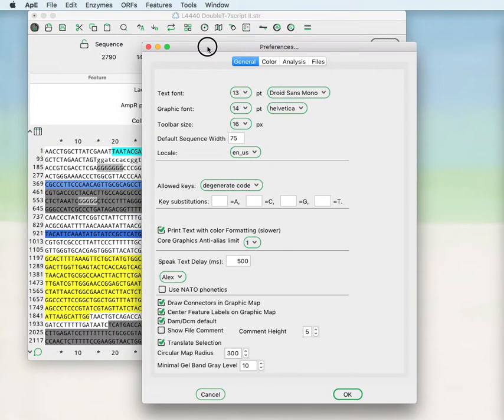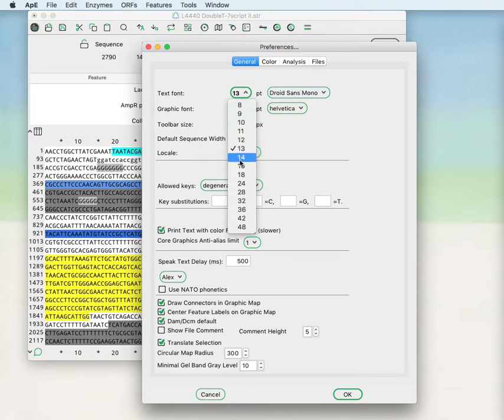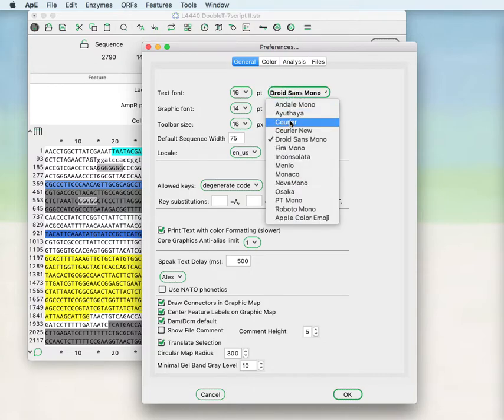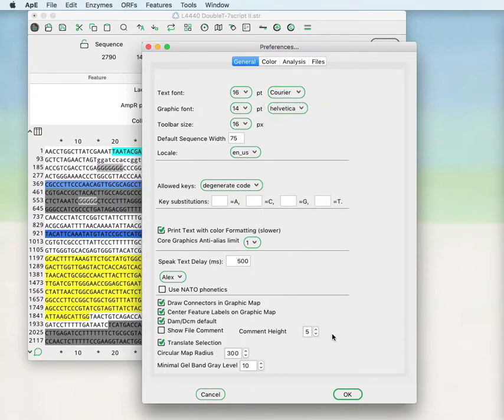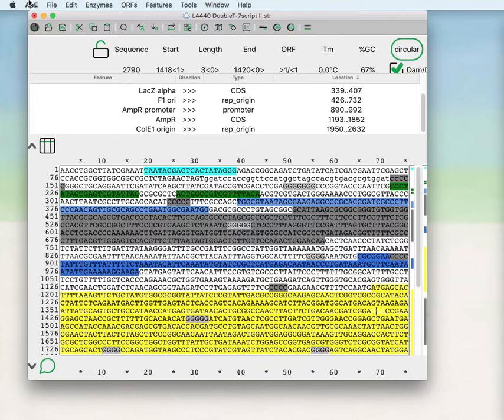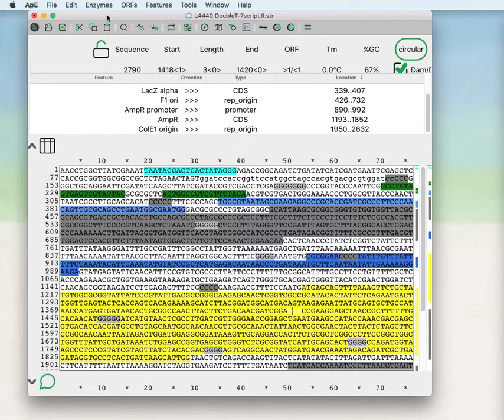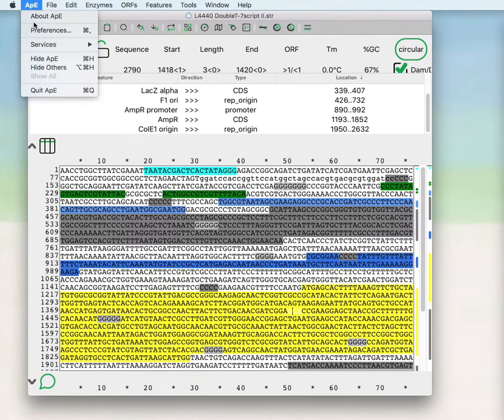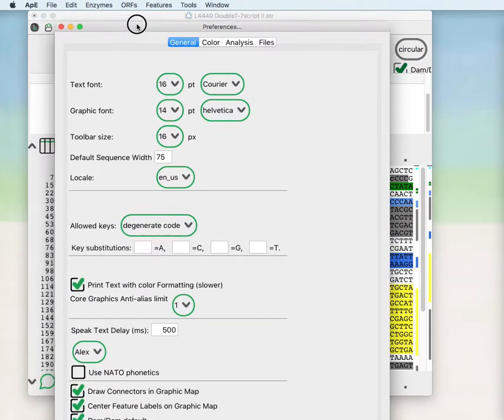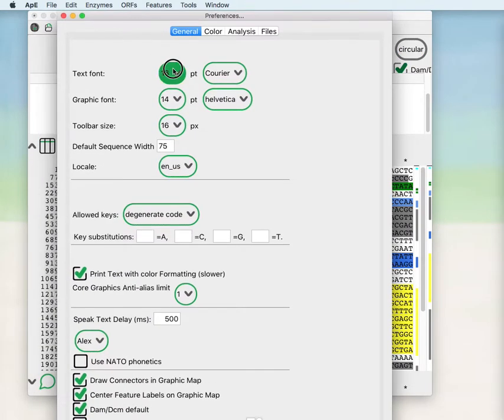You can also within the preferences menu change the size of the text and the font that it's being displayed in. This is very useful for monitors that have a very high or very low pixel density. And I would recommend if you are having trouble on a particular computer monitor going to the preferences and changing the text size so that it's easily visible for your setup.